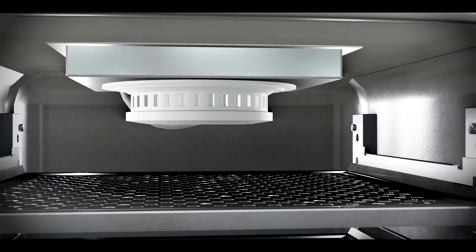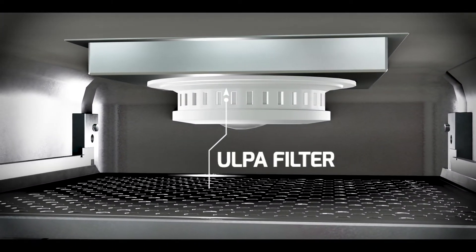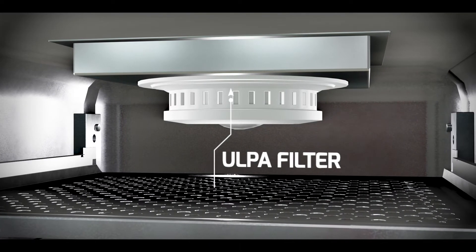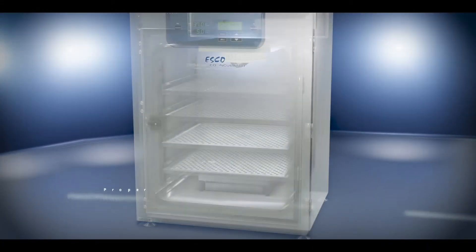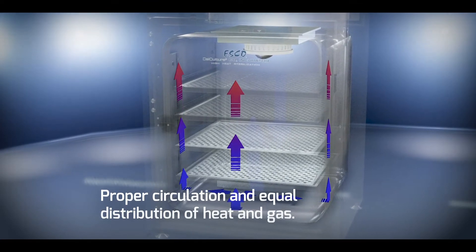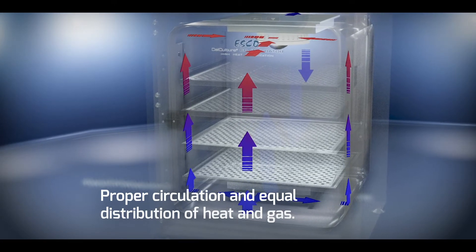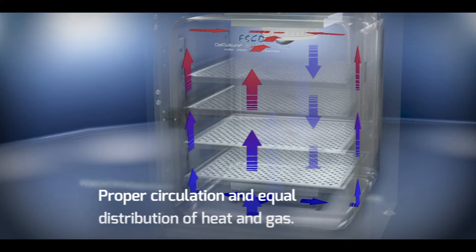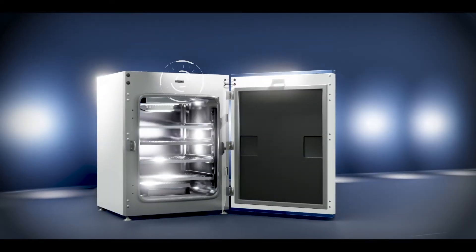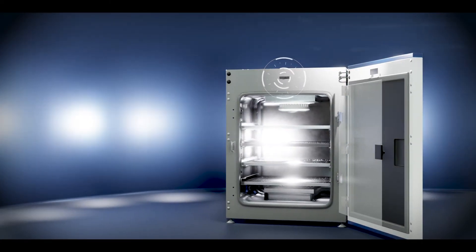The unit is installed with a ULPA filtration system which is 99.999% efficient at 0.1 to 0.3 microns. The filtration system is attached to a blower fan to ensure proper circulation of clean air and equal distribution of heat and gas at any point in the incubator chamber. A door switch automatically turns off the blower and gas supply when the door is opened.